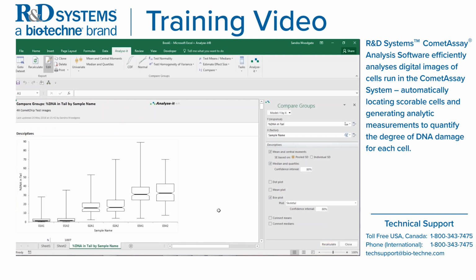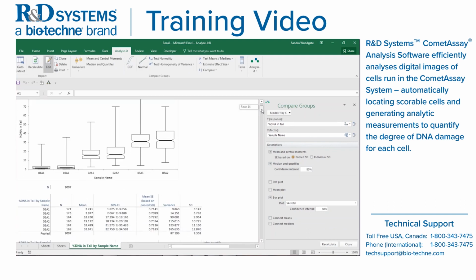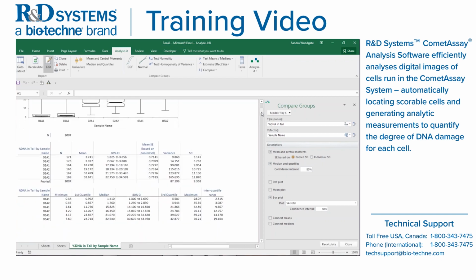And then we've automatically created our box plot with our exported data for these 6 slides. As you can tell, I had duplicate slides for untreated, and this is a low level of treatment, and then a higher level of treatment. And then Excel also generates, it'll give you the means, the medians for each of those wells, as well as the standard deviation or standard error.